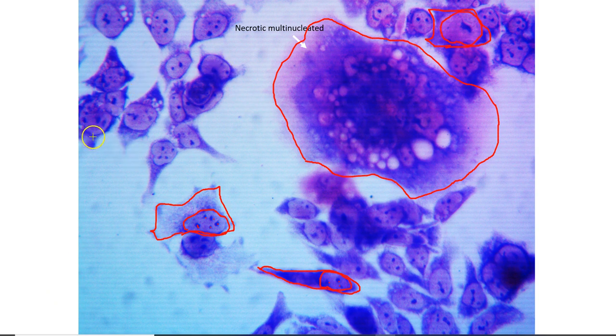And here you have some multinucleated cells. So you can look over here and I can see my membrane, and then multiple nuclei inside. And those nuclei are terrible. There are so many and so variable in size.